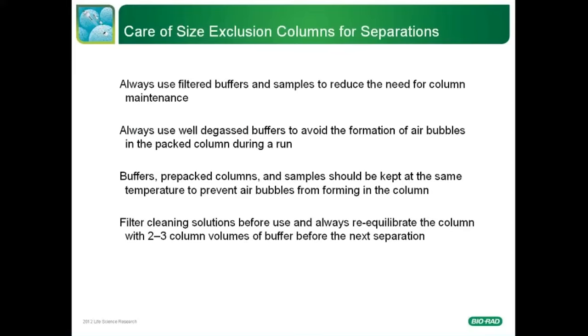column. Filter cleaning solutions before use, and always re-equilibrate the column with 2 to 3 column volumes of buffer before the next separation.